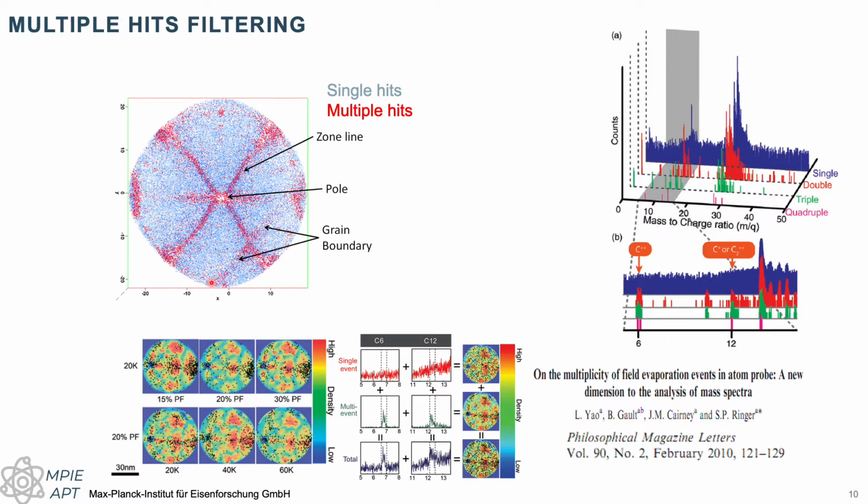field evaporation from taking place, and as soon as one atom leaves the surface, the neighbors left behind are not very happy and they leave during the same pulse. It can be seen as an issue, but it's also an opportunity to dig deeper into the data.